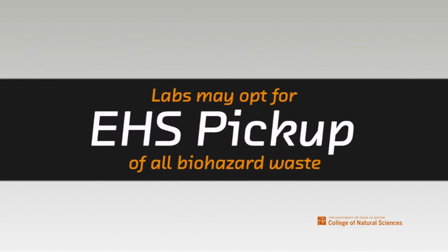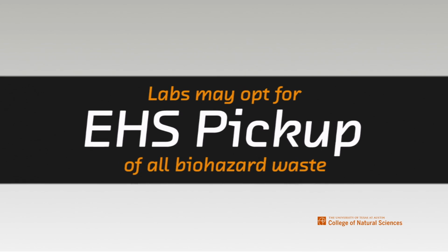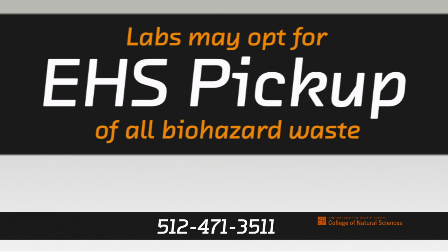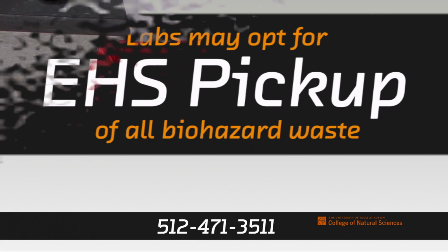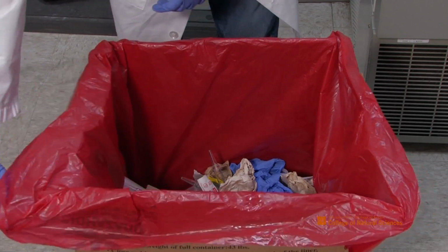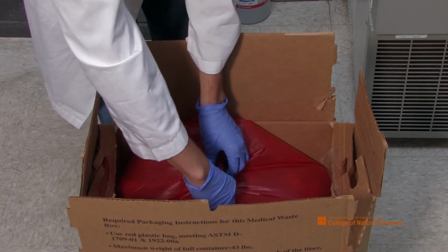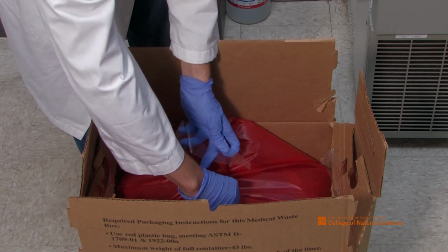The lab generating the waste is not required to treat biohazardous waste. Instead, the lab may opt for EHS to pick up and treat this type of waste. This is the case for many labs. Biohazard waste bags must be securely closed by tying or taping shut and then placed into a biohazard box.